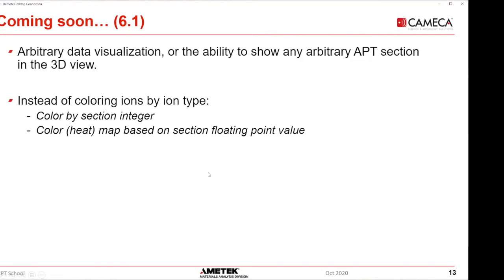Now, one thing I haven't mentioned yet is that when you're creating these columns, you can create them virtually, meaning they're just in memory, and when you close APSuite, they go away.